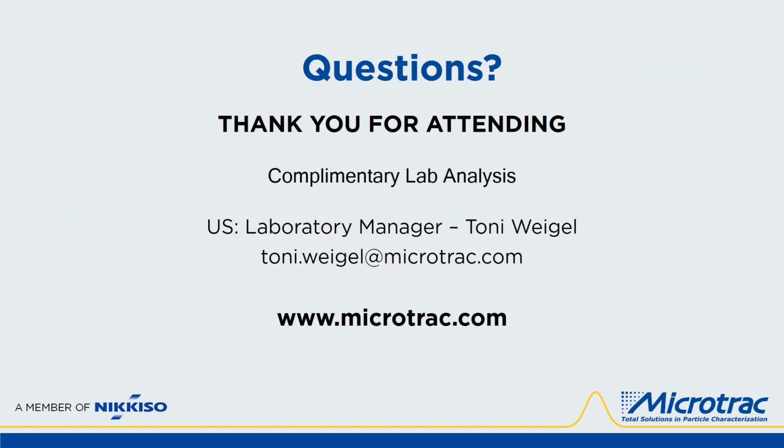Thank you, Terry. We actually have received a couple of questions, and feel free to continue submitting them. So our first question is, is it possible to get size only data and image only data? Yes, it is. There are choices for that.